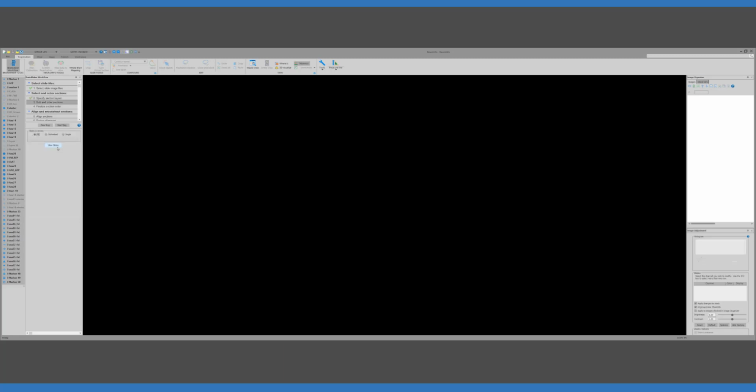There's a number of options to go through here, and if you ever use the program and have any difficulty with it, you can just call the MBF help people, and they'll be able to help you. So now we're going to view those 2 slides that have been put in here.